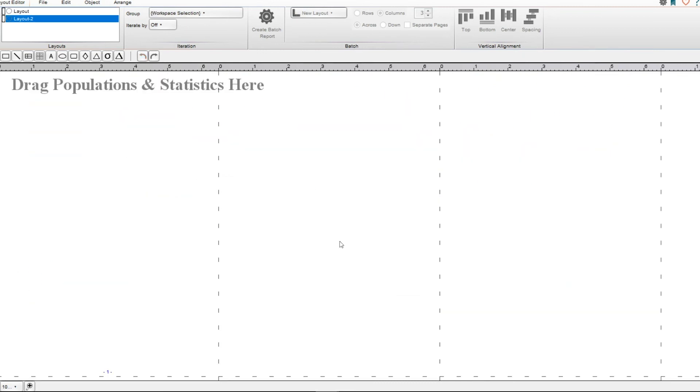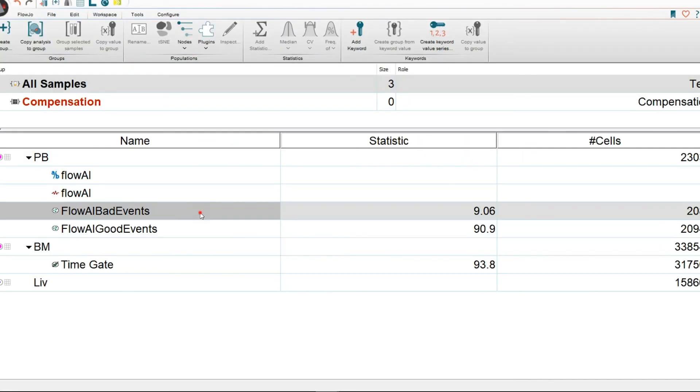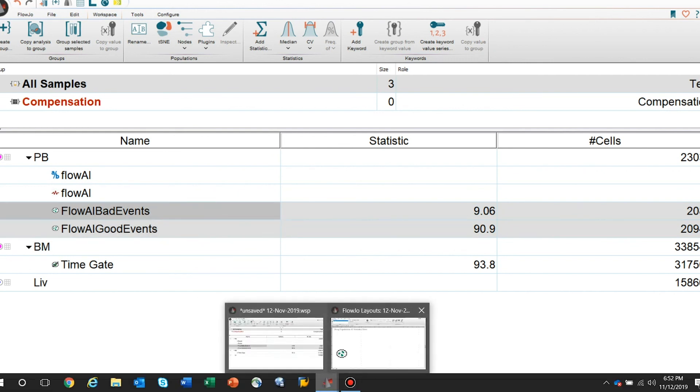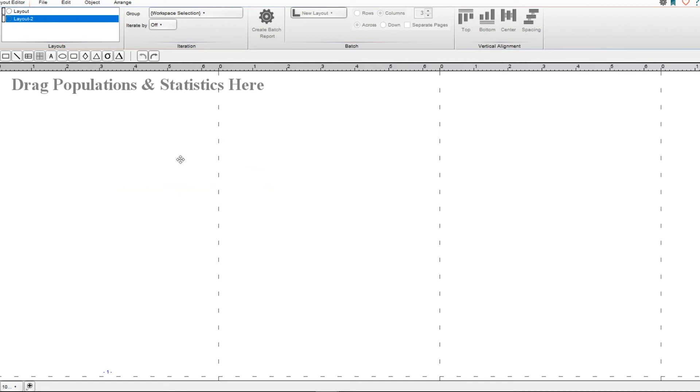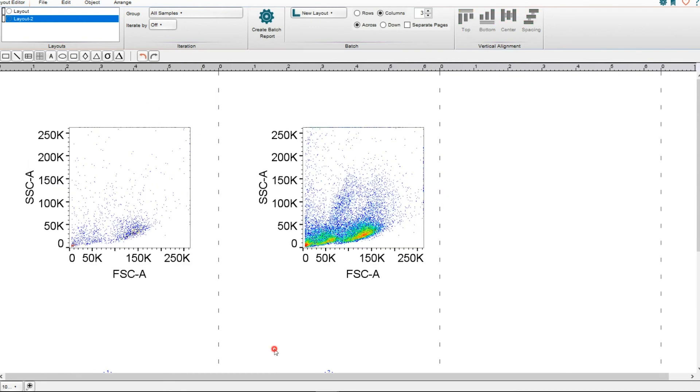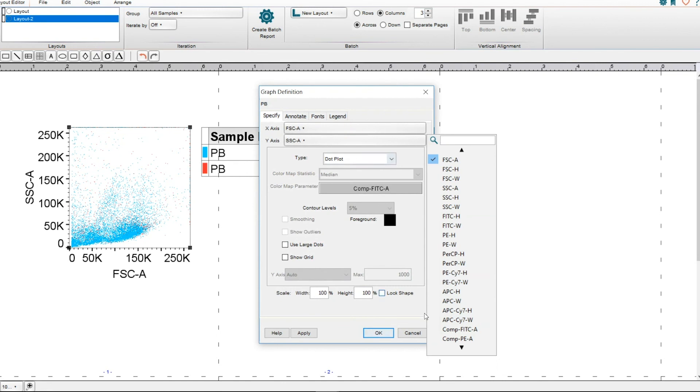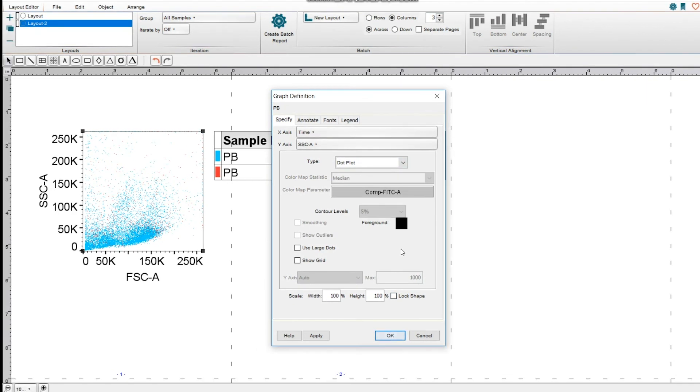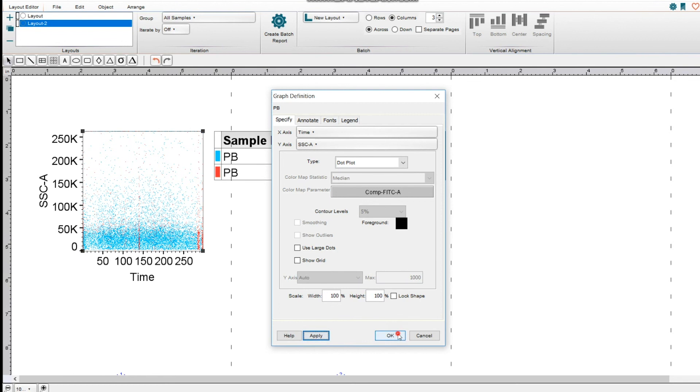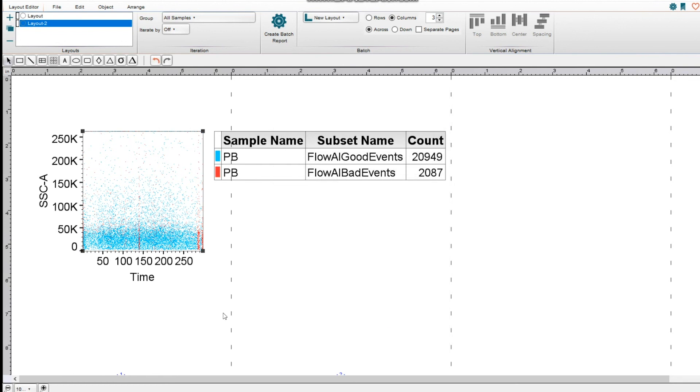Alternatively, we could also create another layout sample, and we could select the two samples, populations, put them in and do an overlay of each other, select the parameters, and then check what it was that got removed per parameter, as you can see here.